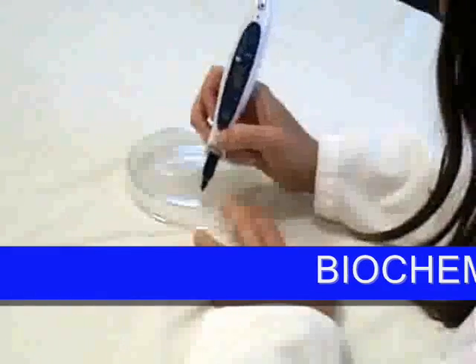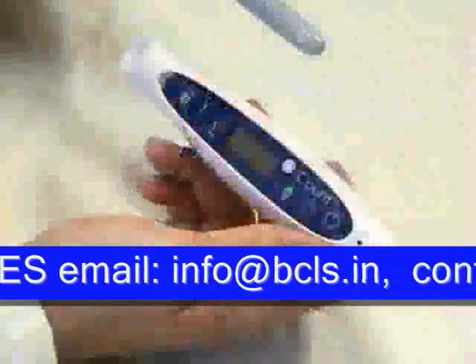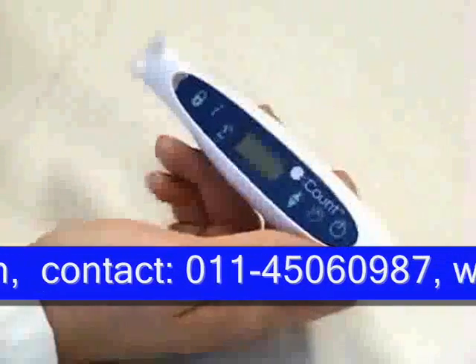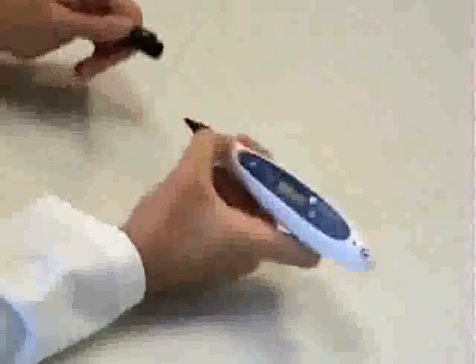The Heathrow Scientific E-Count Colony Counter combines a multifunction electronic counter with a Sharpie pen for marking Petri dishes for accurate colony counting. No need to buy special markers — the E-Count accepts both fine and extra fine point standard Sharpie pens. You can also easily change colors for separate counts.